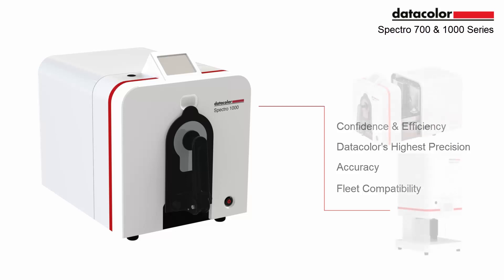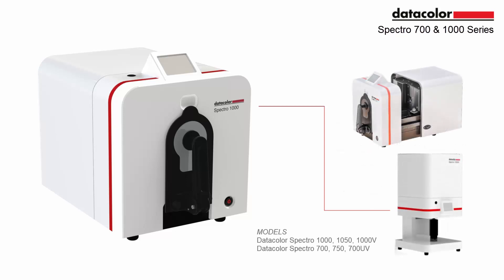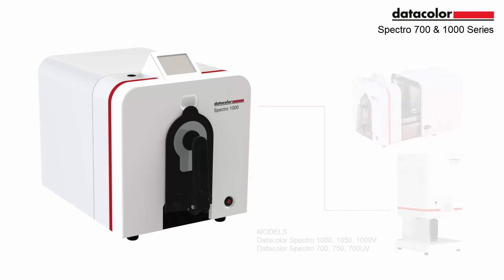The new Datacolor Spectro 700 and 1000 series of spectrophotometers have a new look and new functionality.